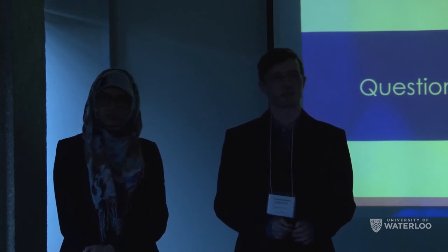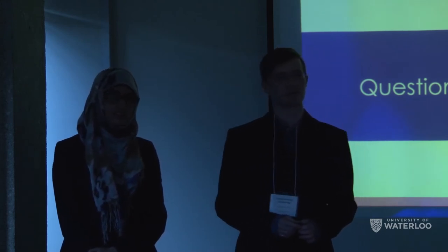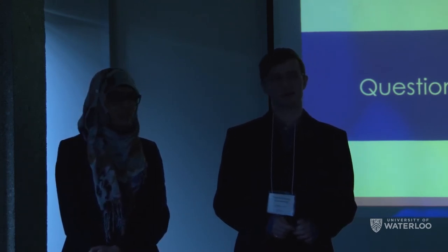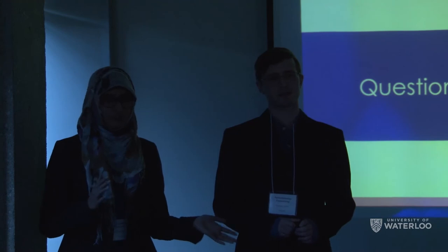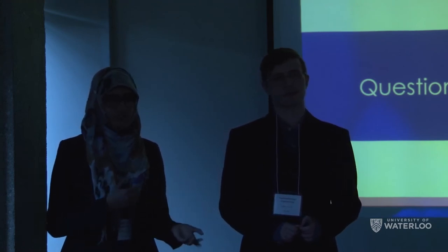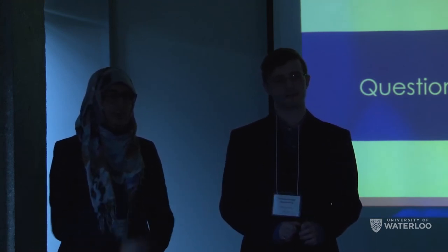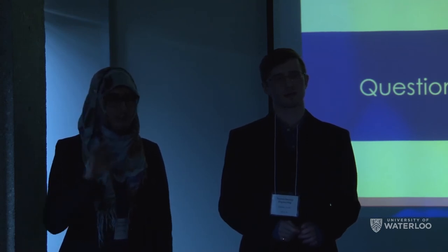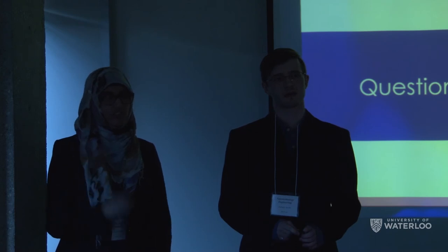Other questions? What's your shelf life? Well, right now, we haven't done a full study specifically for shelf life. This was more of a proof of concept to see that it would be able to bind. But we have some samples that we've kept for up to, I believe, 3 weeks in the fridge, and the aggregates themselves actually stay in solution. They don't crash out or anything. And of course, after you've used the test, it'll be disposed of anyway.